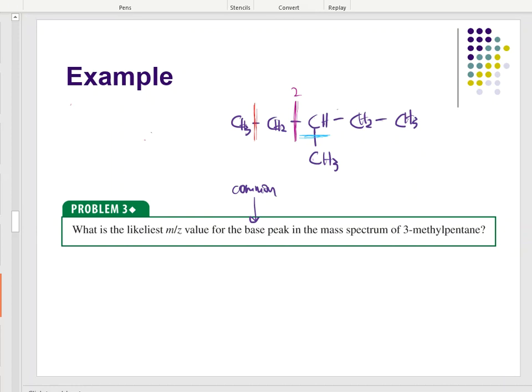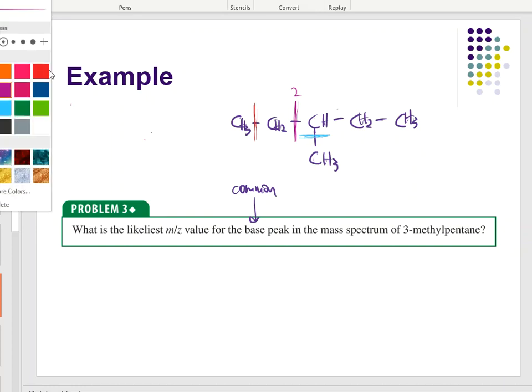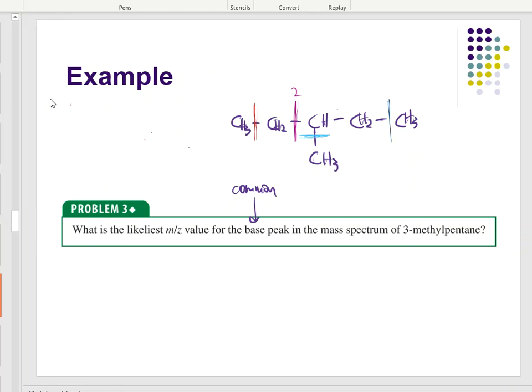And then I can maybe cleave that end carbon, and that end carbon would be here. And I have a 1 carbon with a 1, 2, 3, 4, and 1 hanging off the side. But you know, we already did that one. That was the red line in the very beginning. 1 carbon chain, and then 1, 2, 3, 4 with 1 hanging off the side. So that's not really an option either. I'm going to get rid of that line.